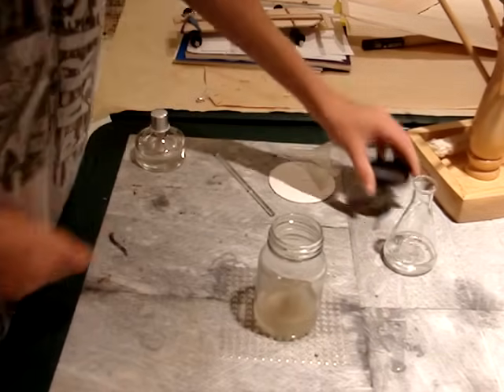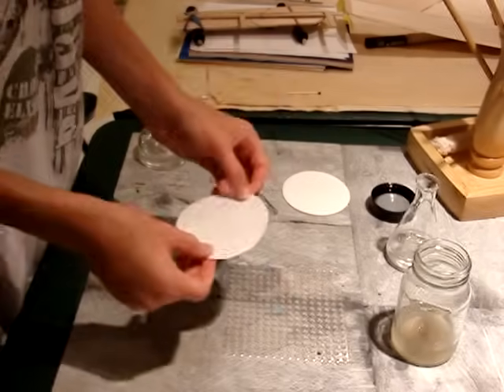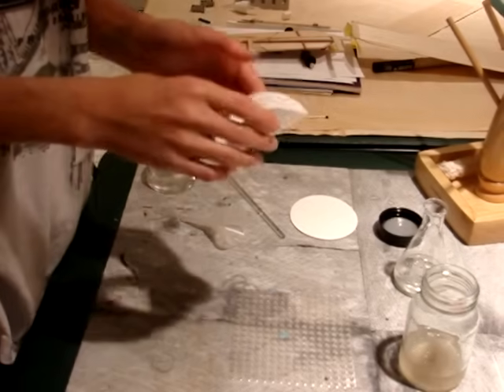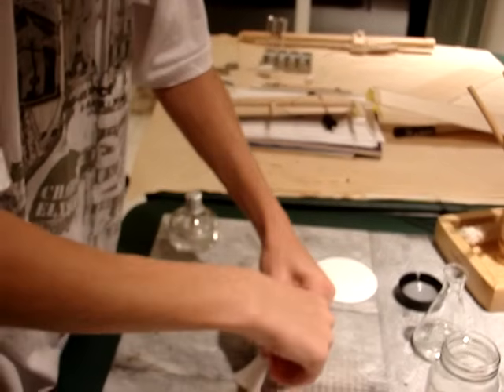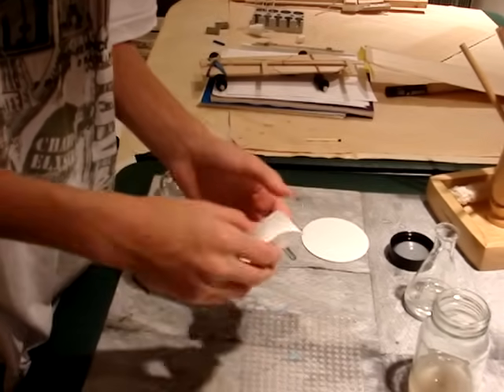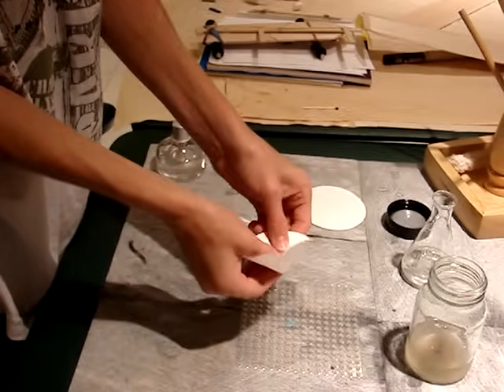So the second step is to make the filter paper go into the filter. And the way I do that is I take a piece of filter paper, like a coffee filter, and I fold it in half. And I fold it the other way, again in half. And then I fold it the other two diagonal ways. So I have eight slices of filter paper, like this.